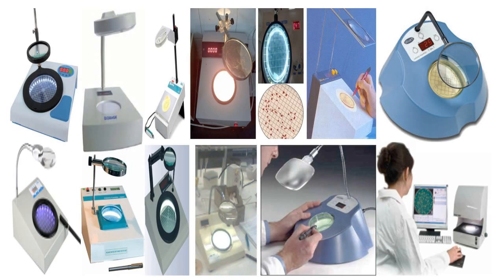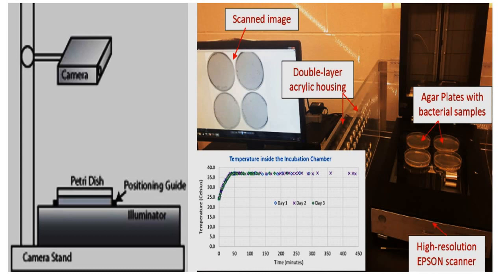Moreover, this slide calculates bacterial colonies by bacterial cell counter. And finally, this slide presented how to calculate bacterial colonies by computer scanner.